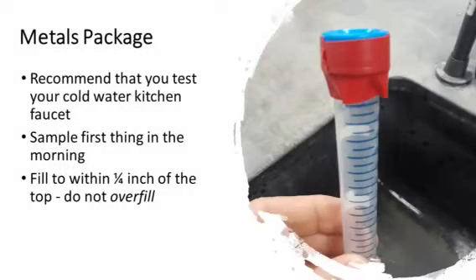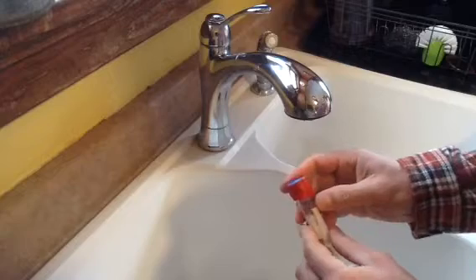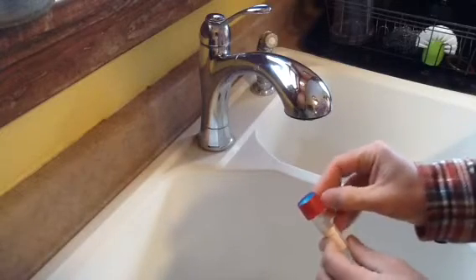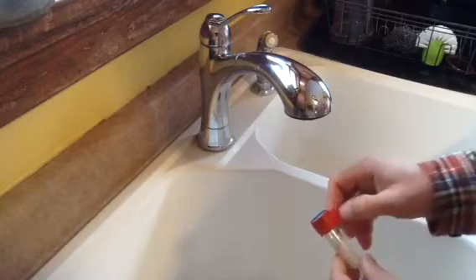Metals package, you're going to use the small vial with the blue cap and the red tape around the cover. For this test, use your cold water kitchen faucet. Sample first thing in the morning before any water is run through the system. We want to try and sample water that's been sitting in the pipes overnight or for an extended period of time. If there's lead or copper in your plumbing system, testing first thing in the morning will tell us the maximum amount of these elements that we'd expect in your drinking water.